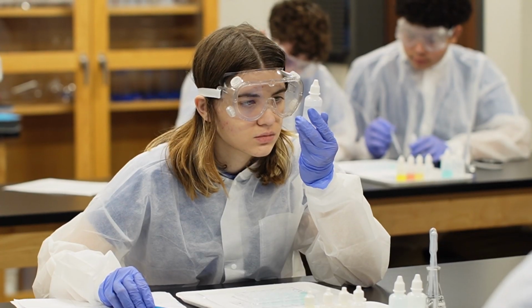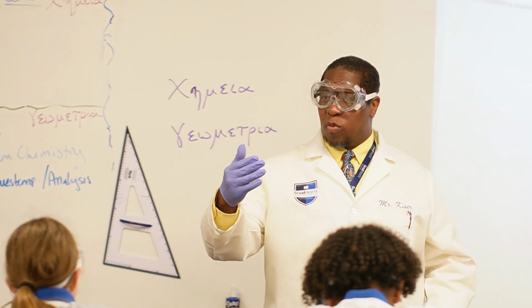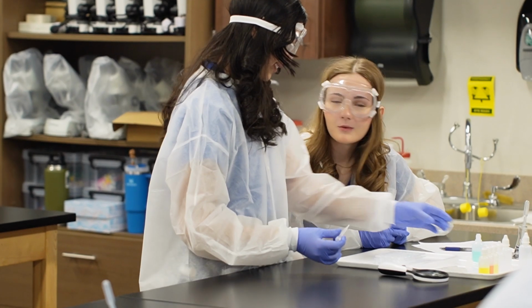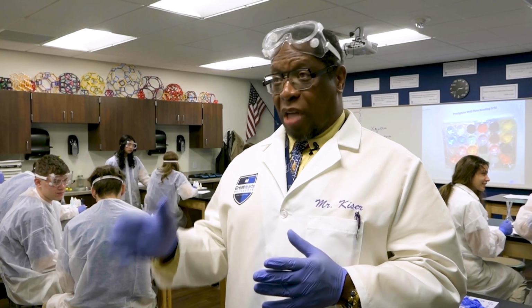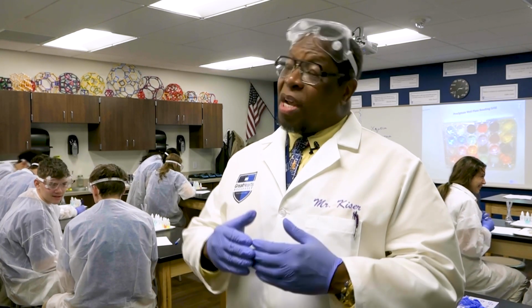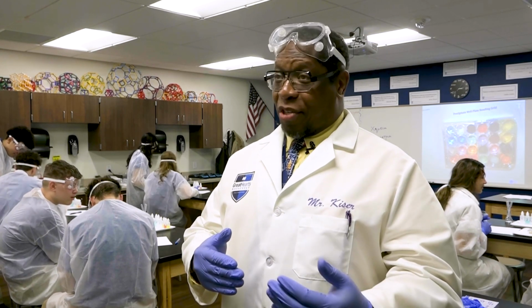But knowing the chemical properties of all of the potential products, they're then going to be able to troubleshoot and Sherlock Holmes the whole thing and then reverse engineer this out to actually figure out what all 7 of these unknowns are, which is a great way for them to tie in several different units as far as knowledge, not just dealing with the reaction chemistry, but also the behavior of transition metal ions, and then also use this as a stepping stone to what we're going to do next as far as spectrophotometry and how some of the light or the colorimetric behaviors for these ions then tie into the next units.